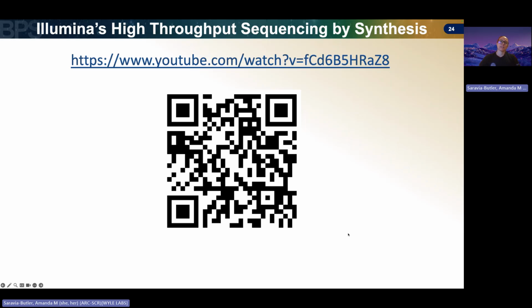And so this brings me to my last slide. Normally, if I was teaching this live, I would play this video. However, this video is not mine. This is a video from Illumina. It shows a great illustration of their high throughput sequencing by synthesis.